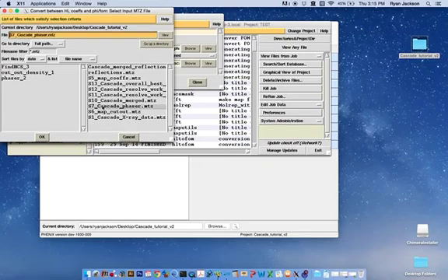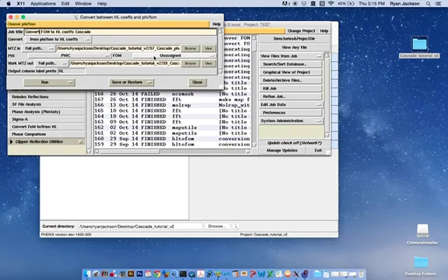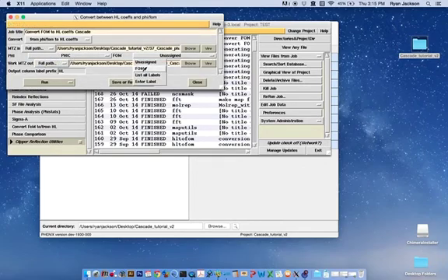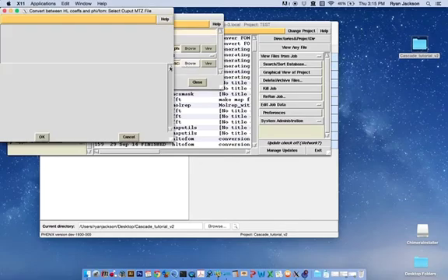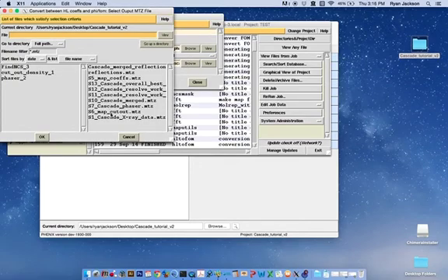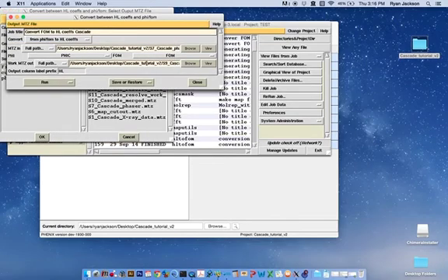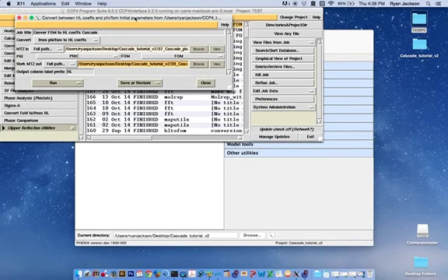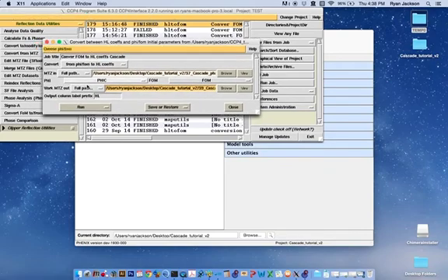We'll select this file here. And then, we need to make sure that we have the right array selected here. This should be FIC, and here, this needs to be FOM. And then, the work MTZ out file. We're going to call this Supplemental File 9, Cascade Phaser HL MTZ.